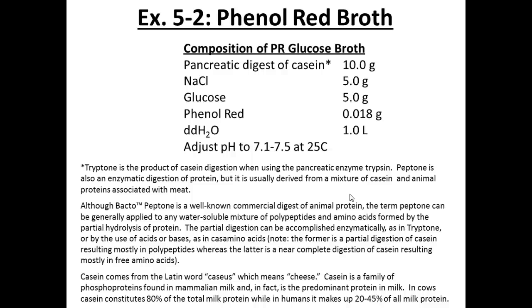If you were to let it go, if I left it in the incubator like I did Yvonne's and it turned pink, that bubble would clue you in that, wait a minute, maybe something happened before he ate the protein. Maybe they digested or fermented the sugar first, because that's the only way you get gas production. And that's an important point: it's only with fermentation that you're going to get gas production, right? So if you've got a pink tube with gas, the question is, what's going on here? How did that happen? They had to have eaten the sugar in order to get that gas bubble.